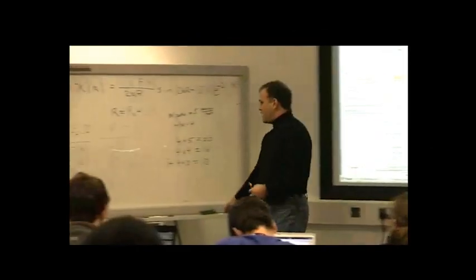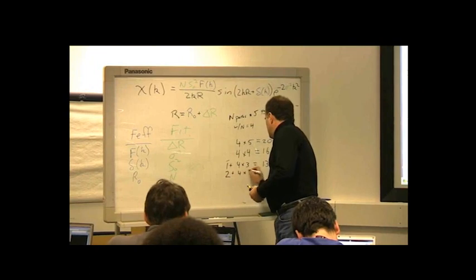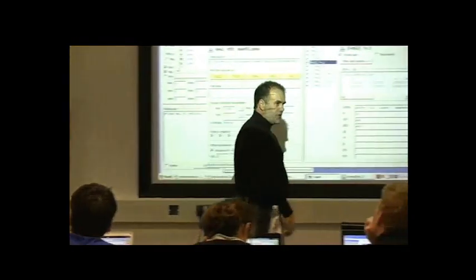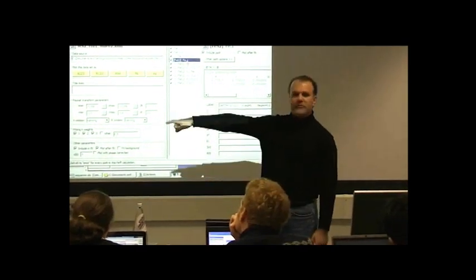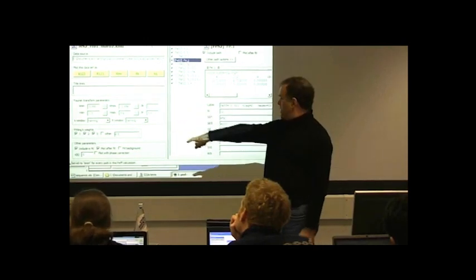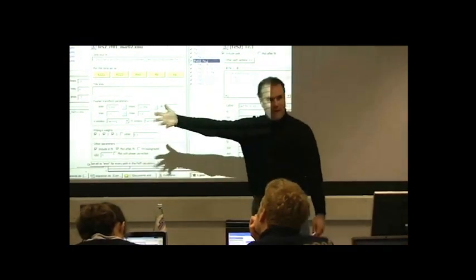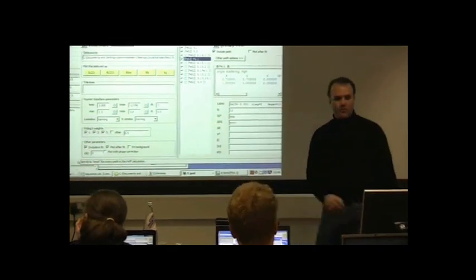We're now at 2 plus 4 times 2, which is equal to 10. So again, by thinking about the meanings of the parameters, we've reduced the scope of the problem dramatically. We've already cut the scope of the problem in half from 20 to 10, which is now below our number of independent points. So it's starting to look feasible that we can actually measure this thing. And we just thought about some simple principles.